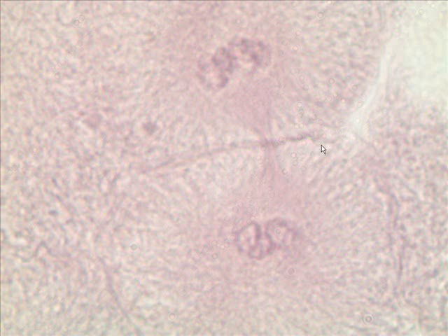And now the cells have just about divided. This would be very late telophase. We'd have a new nuclear envelope forming in each cell, the chromosomes starting to uncoil to where you won't be able to see them. So very, very late telophase.